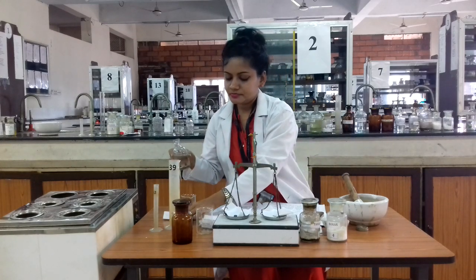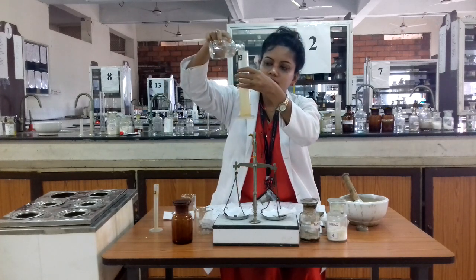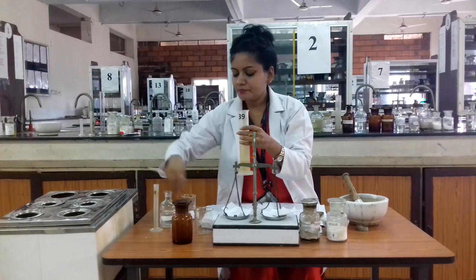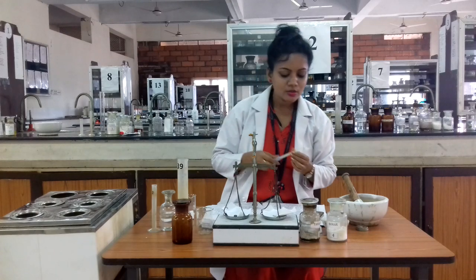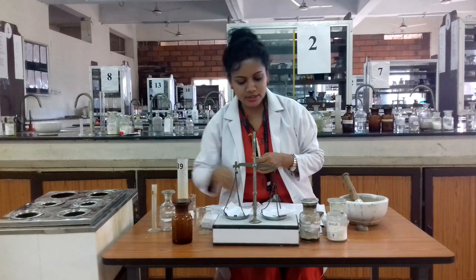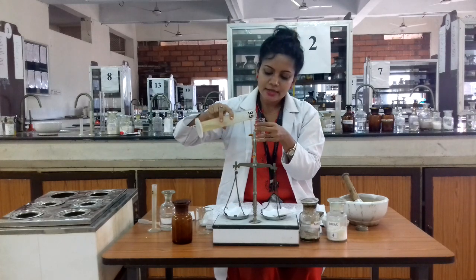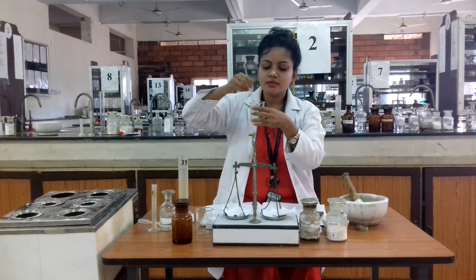We add 20 ml of glycerin to the beaker, adding it only drop by drop. Continuous stirring is important. First we add a small amount of glycerin to the beaker and stir well.